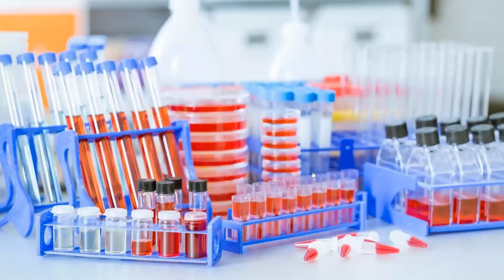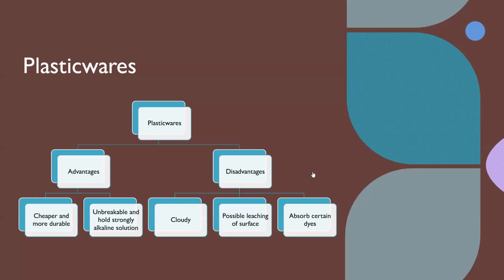The next in line is the one that we really hate, the plastics. You're laughing because I am aware that you don't like that. But in the clinical laboratory, plasticware is an alternative to our glasswares. Why? It's cheaper. You don't have to clean it, just simply dispose of it. There is an advantage and a disadvantage of using plasticware. Let's discuss first the advantages. Number one, cheaper and more durable.